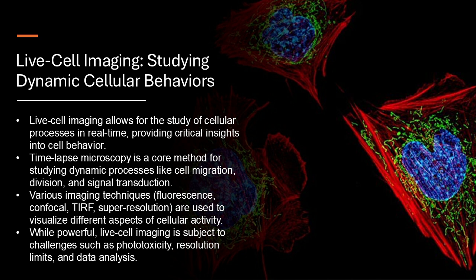Exactly. And live cell imaging isn't just helping us understand movement, it's also providing incredible insights into another fundamental process, cell division. Remember that intricate dance of chromosomes we talked about earlier? Of course, it was mesmerizing to watch. With live cell imaging, we can watch that entire process unfold in real time, including all the steps of mitosis, where a single cell divides into two identical daughter cells.